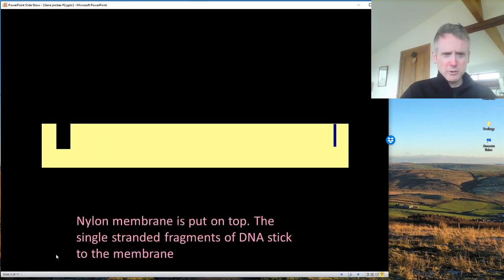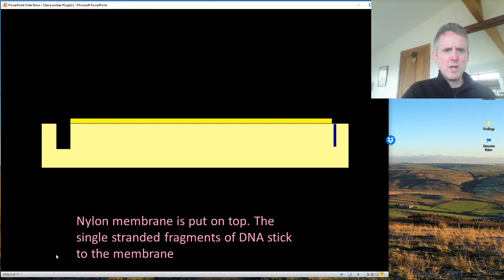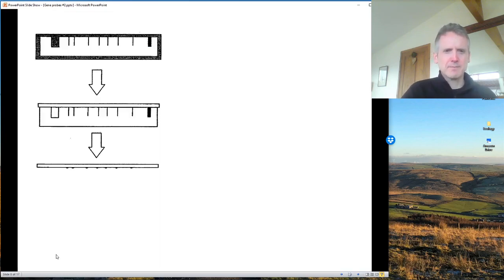We'll summarise this in a minute. So this is the gel side on. It's got DNA inside it. It's single-stranded now, and we apply a nylon membrane or a nylon filter to it. You pack the top with paper towels, and it draws the DNA onto the nylon membrane. It's like wearing a nylon shirt and getting static: the sugar phosphate backbones like to stick to nylon, so it draws it out of the gel.